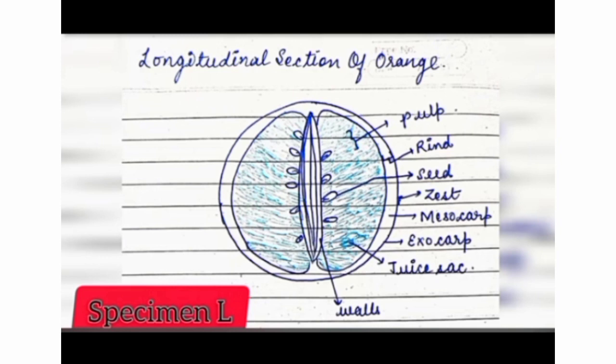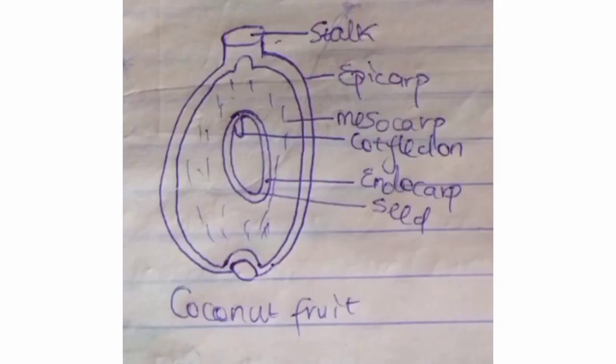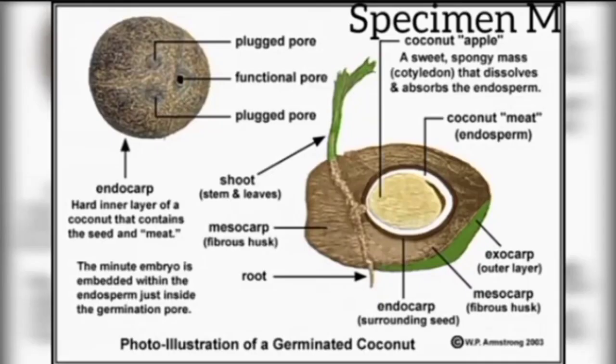It has a mesocarp. You can see it there. So that is it. Then we'll have a coconut. Coconut is a drupe, while the orange goes for berry. This drupe has an endocarp, mesocarp, and exocarp. The mesocarp is fibrous. Drupes are always fibrous, and examples of drupes include mangoes and coconut. These are the drupes. They fall in the category of the drupe.